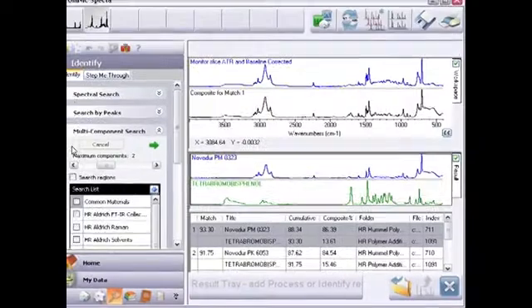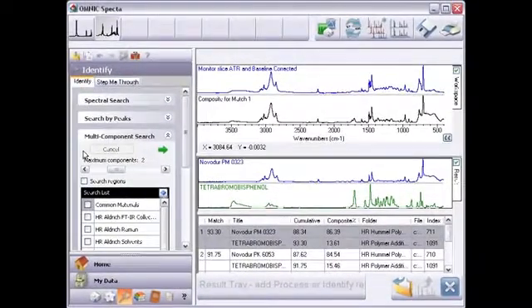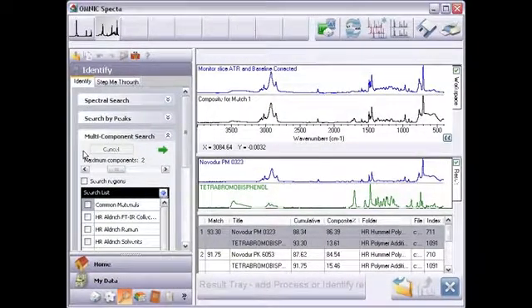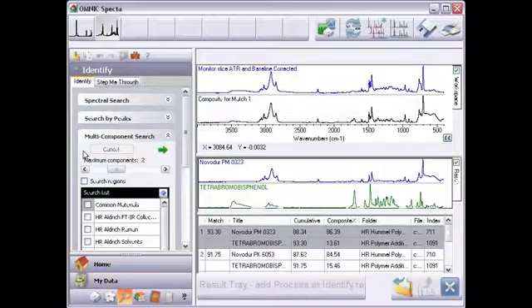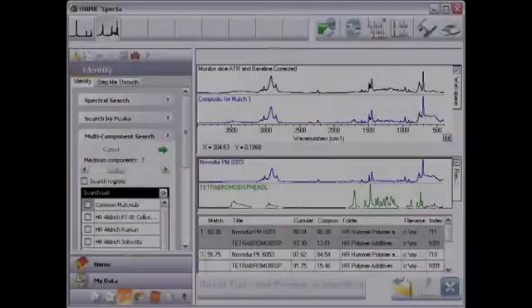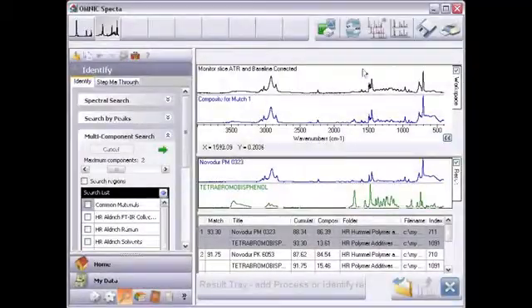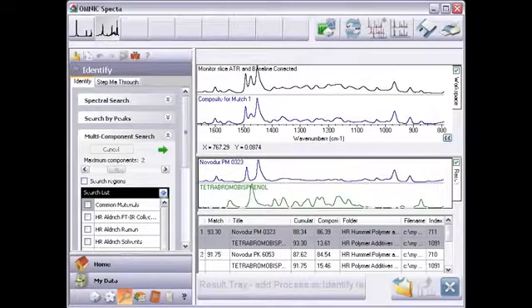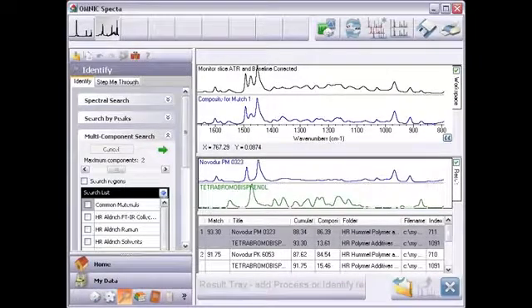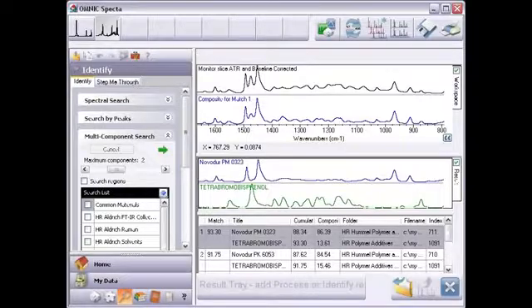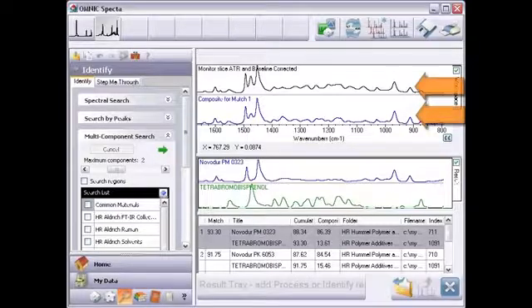I'll show you how to use spectra's many display options to visually compare search results with your unknowns to verify the quality of the match. Let's take a closer look. Here is a region where some differences are present between the original spectrum and the main component. When you include both references as represented by the composite spectrum in the workspace pane, you can see that the agreement is excellent.